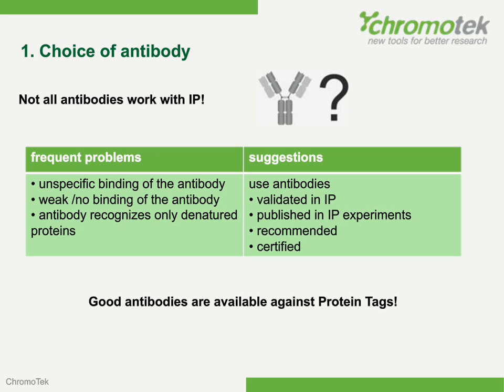And please also remember there are antibodies which are very well working in Western blot, but this doesn't mean that they immediately also work for IP, because it might be the case that this antibody only recognizes denatured proteins, and during your IP you normally want to have your protein in a non-denatured form.